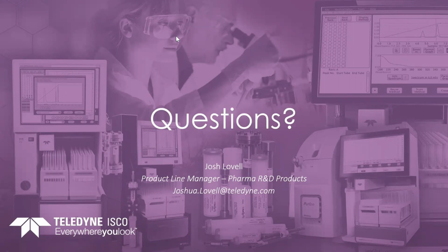They're pretty specific. I need a little bit more details, but, is it common to see your product come out in two different retention times? I'd say it's not common, but this happens sometimes. Usually what happens is maybe you have the neutral compound and the charged compound in equilibrium under the solvent conditions that you're running at. And a lot of times if you add an acid or a basic modifier to that, then you force that equilibrium to one state or the other.